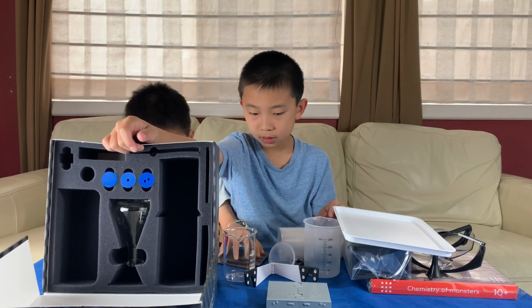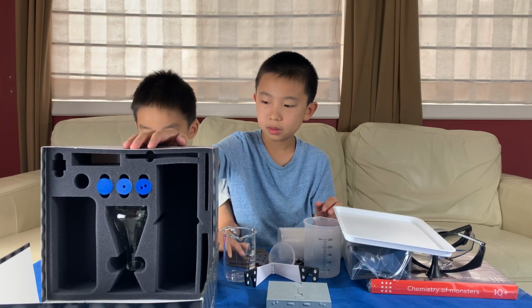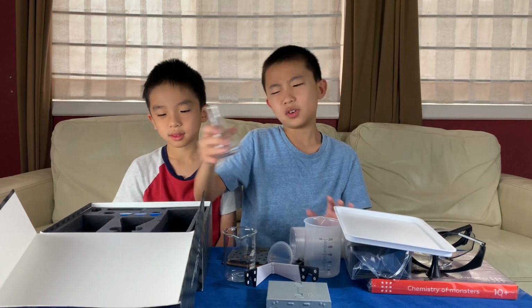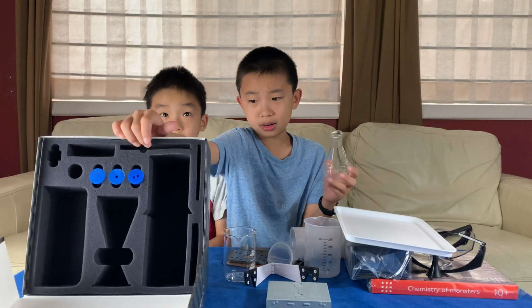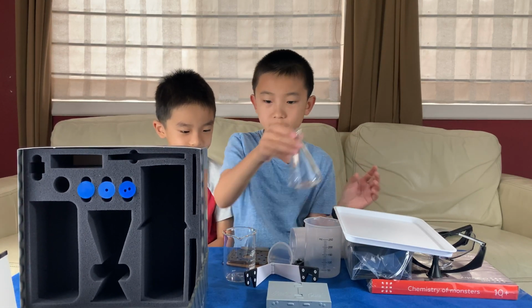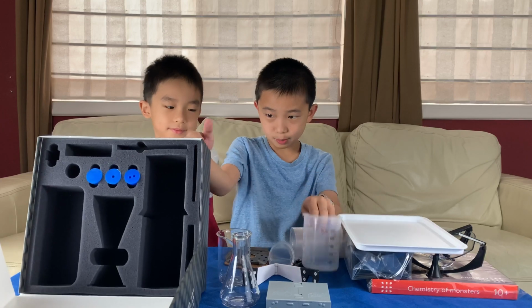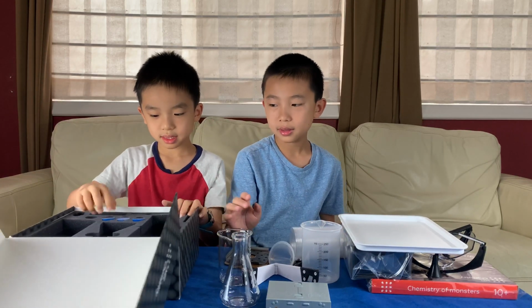Experiment time. Oh, hold on. It says that this glass flask, where is it? Here. This is for heating. And then another thing that's for heating is the glass beaker. I guess this one. So the glass can be for heating. And this plastic beaker is not for heating. Okay.